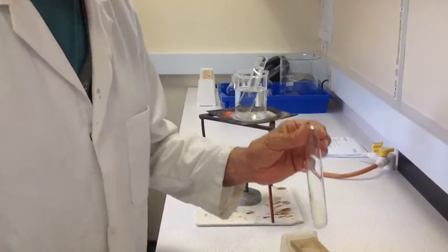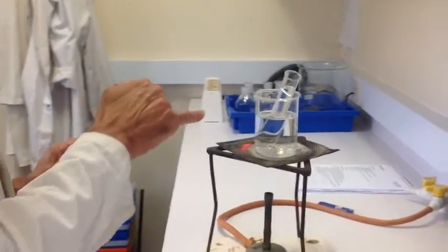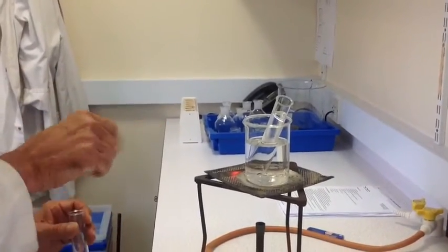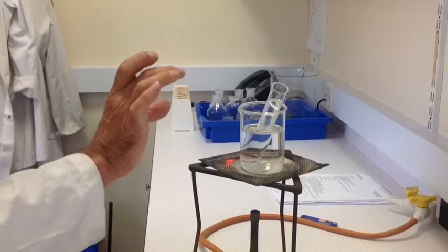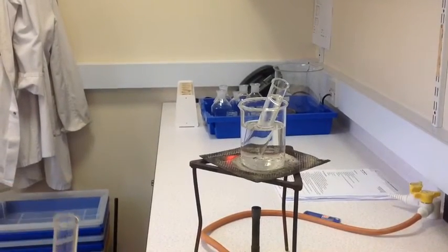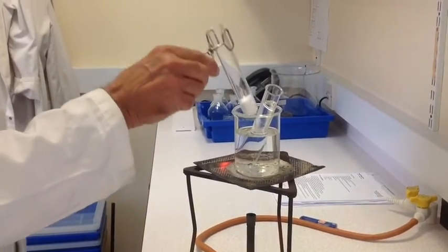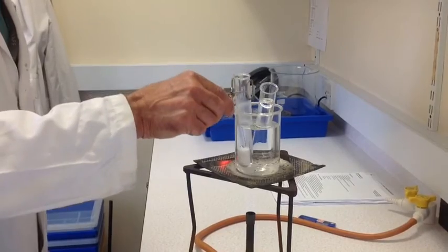I'm going to now place this into a hot water bath I've already prepared. Also in the hot water bath is a separate tube of deionized water which has been warming up previously. So I'll take the boiling tube and place this in the bath.